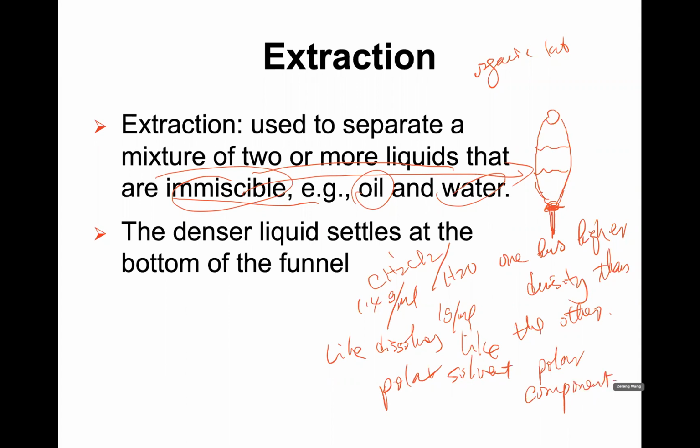Likewise, nonpolar solvent will dissolve nonpolar components, right? Now, if that's the case, then you can see, for example, here, this one is a layer of CH2Cl2, and this one is water. Then if you have sodium chloride, for example, sodium chloride will go to the aqueous phase, but not go to this layer. Then you can allow them to drip and separate them. So that's what we often use in the lab.